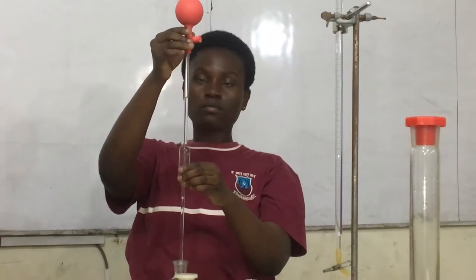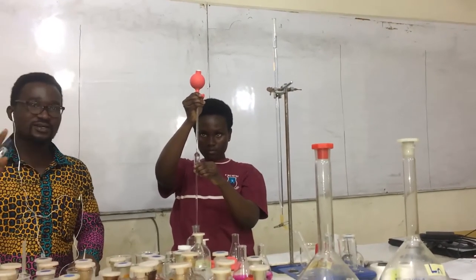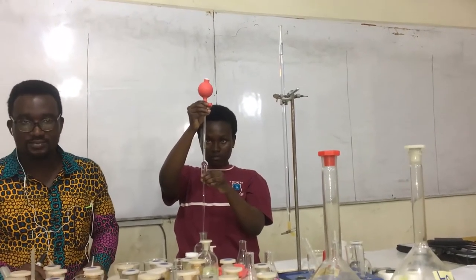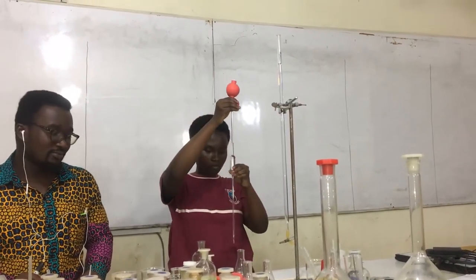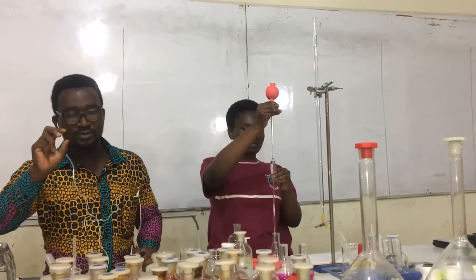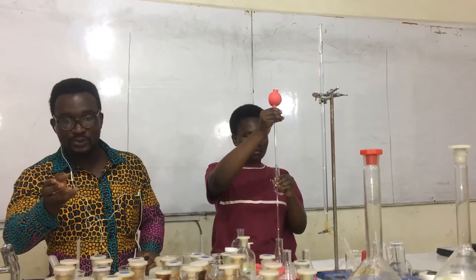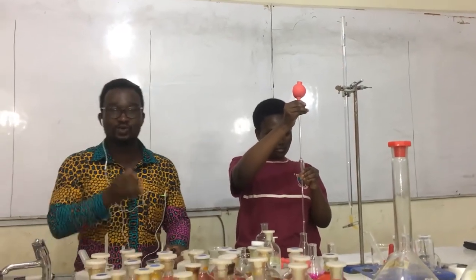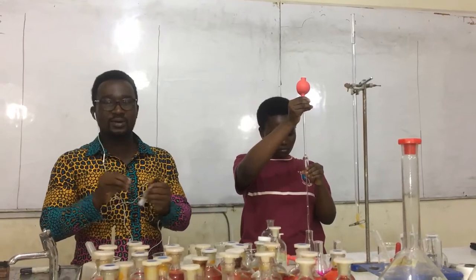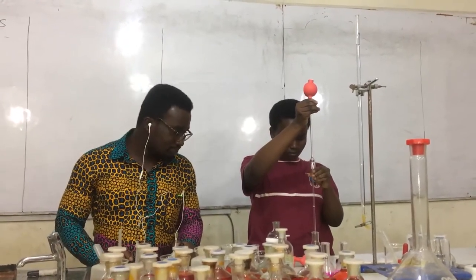Remember, in WASSCE, don't make that mistake. When you realize that you have air bubbles inside, just flush it out and then repipette the whole volume again. Other than that, the few centimeter cube of the air bubbles will also take part in the volume. So it means that the volume you are thinking is 25 centimeter cube is not the actual volume, because the air bubbles have also taken a portion.